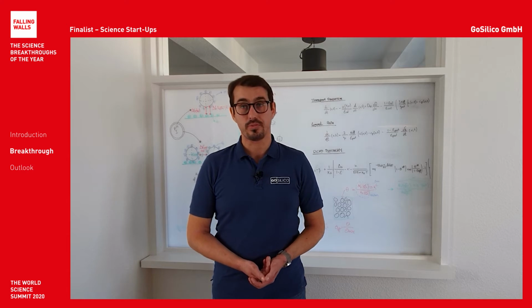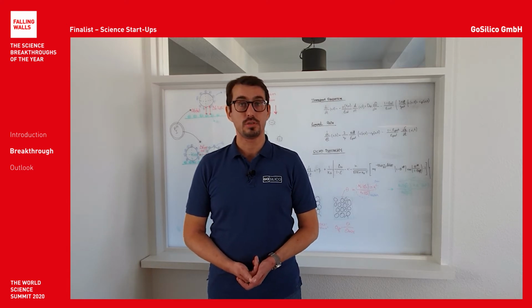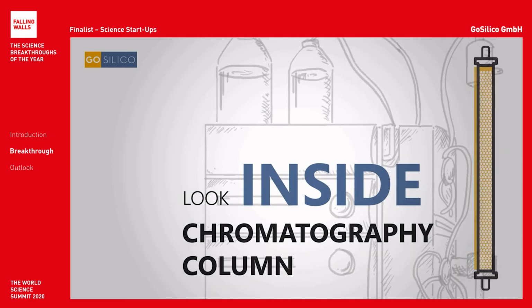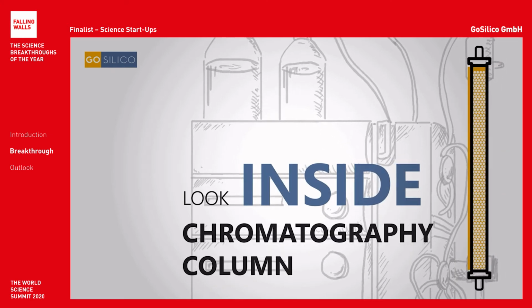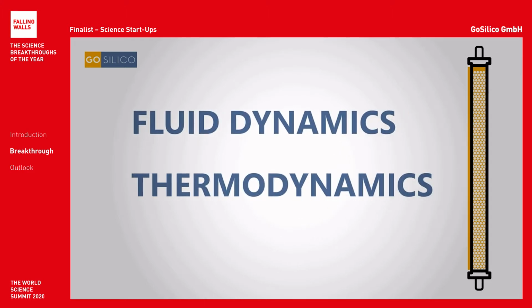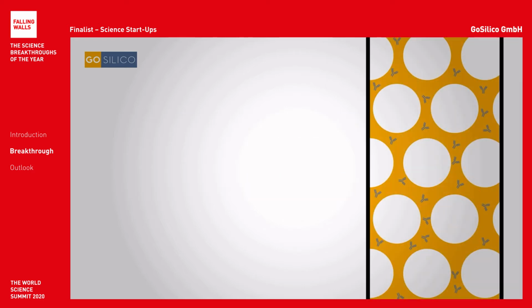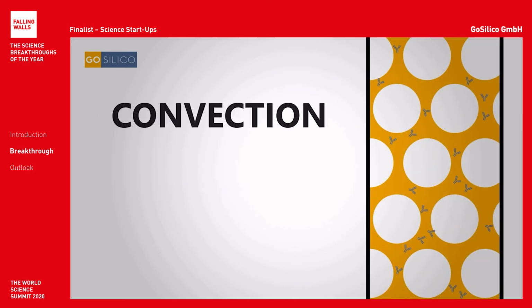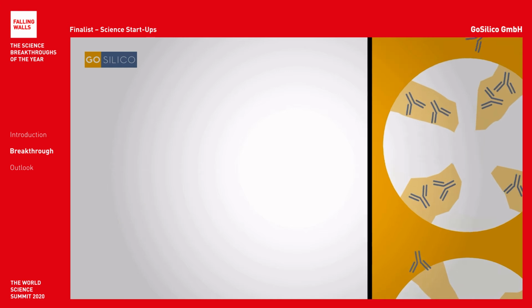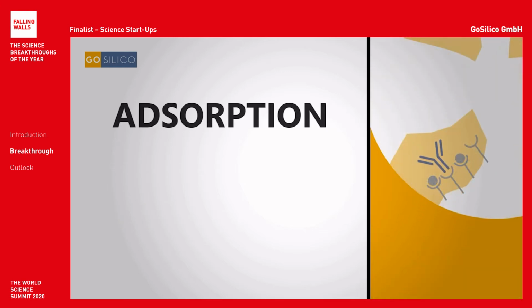Let's look at chromatography, the most important technology for producing biopharmaceuticals. What happens during such a purification process can be explained by studying the underlying fluid dynamic and thermodynamic phenomena in the chromatography system. To name a few effects, the molecule to be purified is transported by convection and diffusion, followed by adsorption to the surface of the chromatography material.